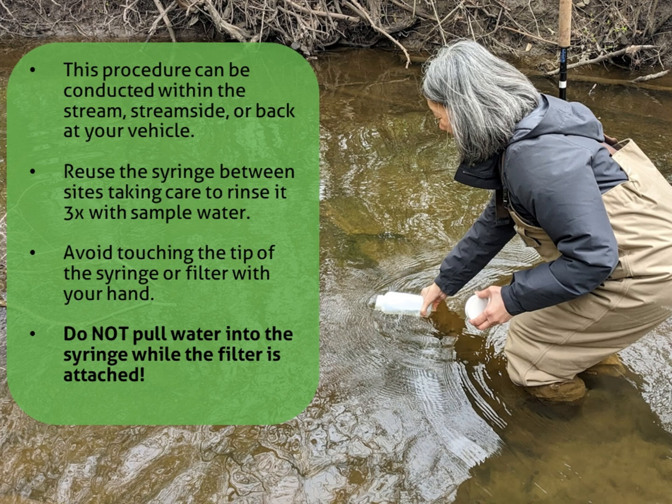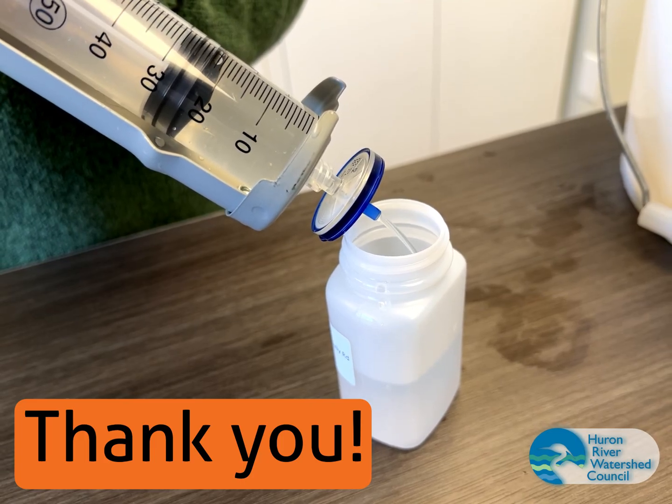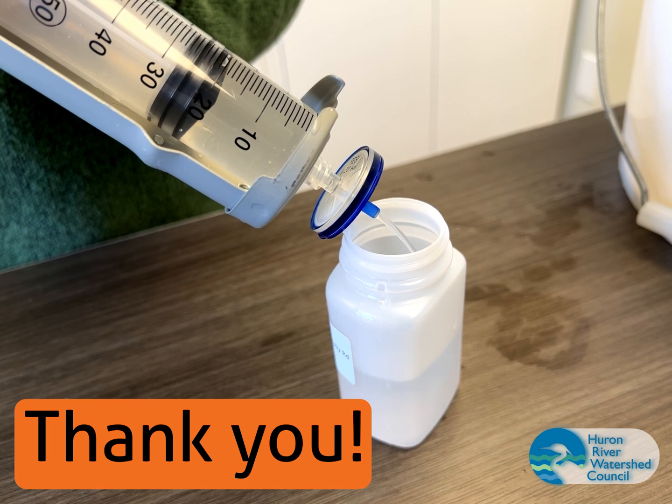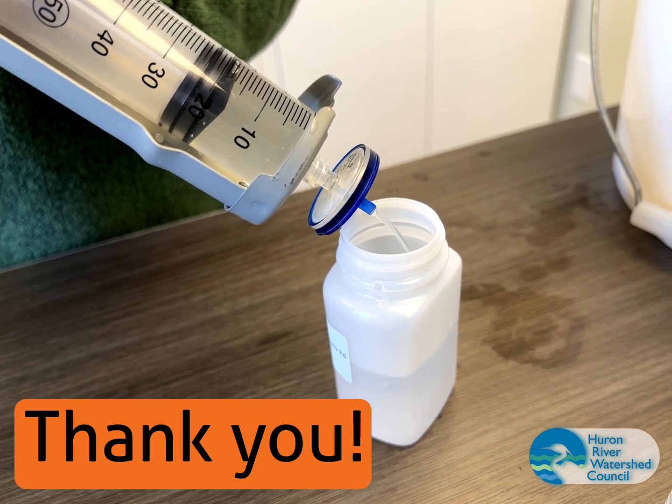And lastly, do not pull water into the syringe while the filter is attached. Make sure to remove the filter before pulling up more water and reattach it afterwards. Thank you for volunteering with the Huron River Watershed Council's Chemistry and Flow Monitoring Program and for taking the time to learn this procedure. Take care.